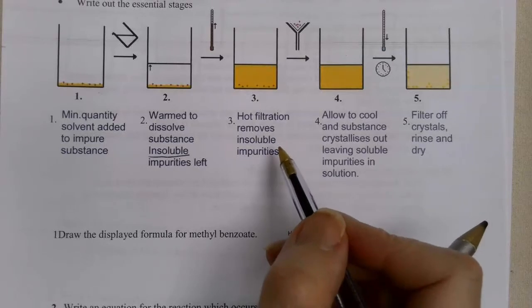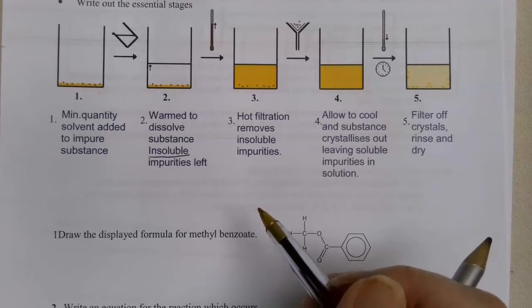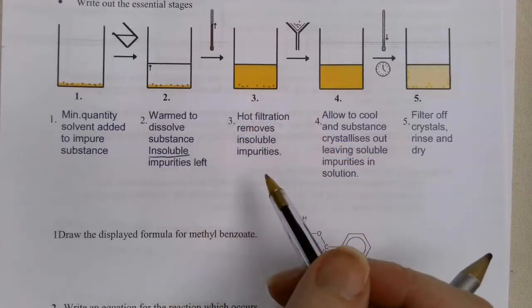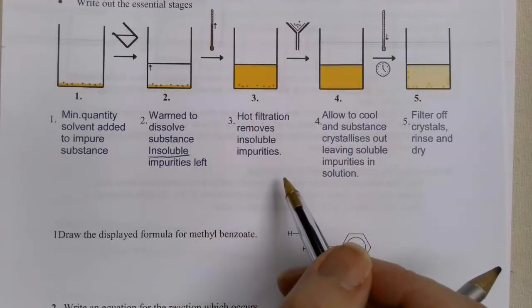The next stage needs to be done quickly, and we do a quick hot filtration. So that will leave behind the insoluble impurities. They will stay on the filter paper and we will collect the filtrate. We'll then allow our substance to cool.